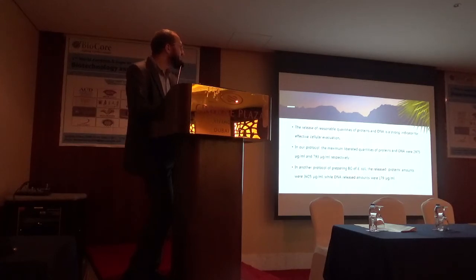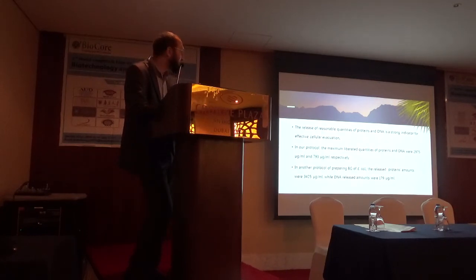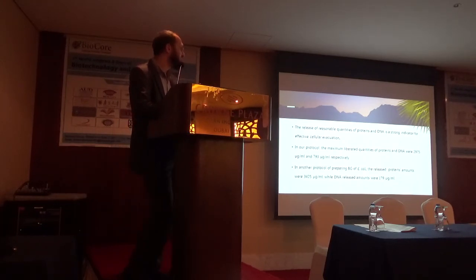The release of reasonable quantities of proteins and DNA is a strong indicator of effective preparation of ghosts. In our protocol, the maximum liberated quantities of proteins and DNA were 2975 microgram per ml and 793 microgram per ml respectively for proteins and DNA. In other protocols, for example preparing E. coli, the highest amount of proteins released was about 3425 and the DNA released 179.